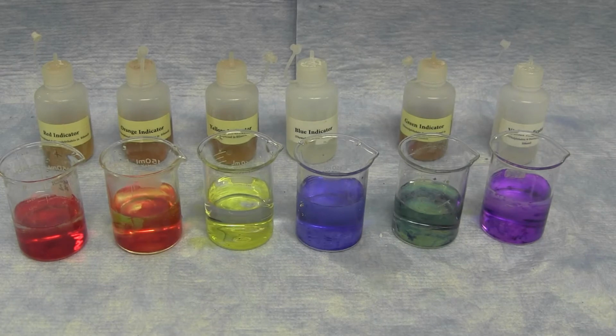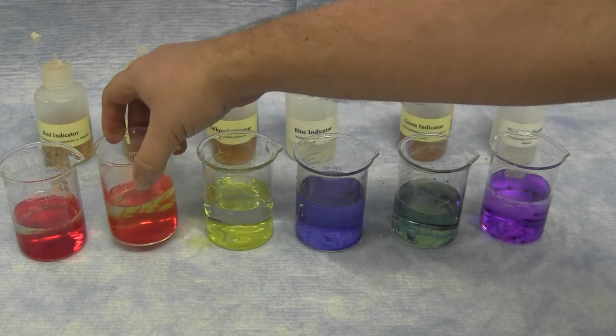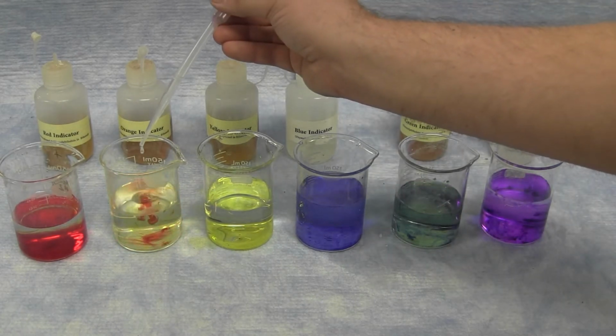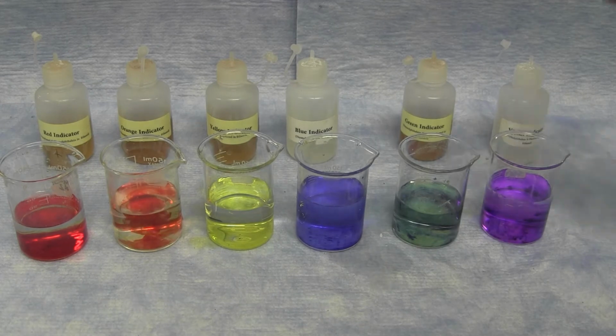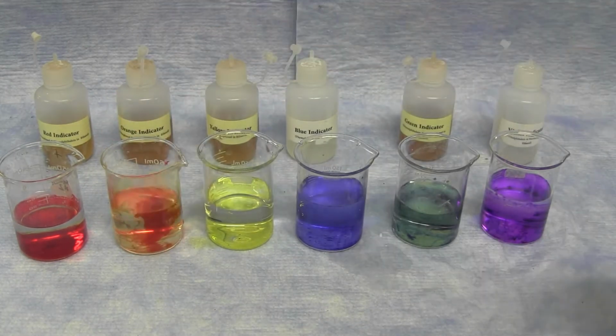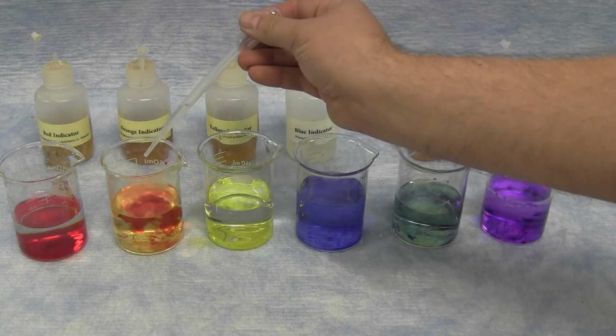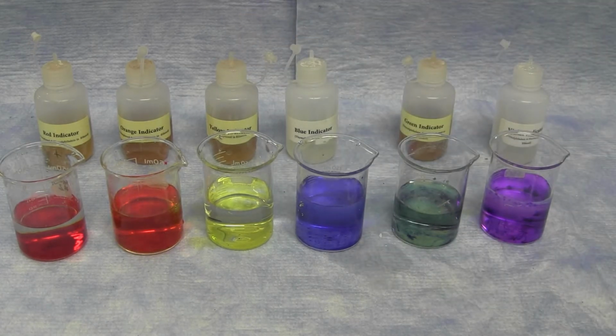These different indicators all change color at a different pH. They're mixtures of a few different indicators to produce these types of colors. But overall, indicators will change color at a different pH level, so you can use that indicator range to determine the most appropriate pH to use a particular indicator.